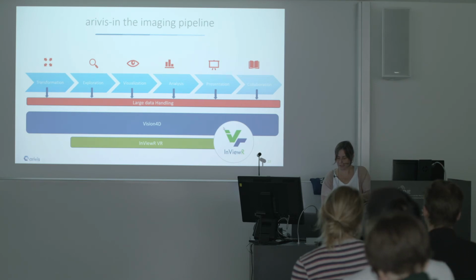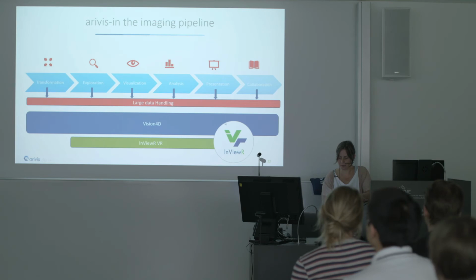And what we believe, being experts in software development and software engineering, is that you can extend the functions which I've shown for Vision 4D in terms of exploration, going inside the data, going inside the microscopic image. And that is what we call the ARIVIS VR.